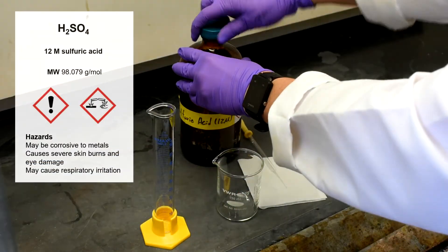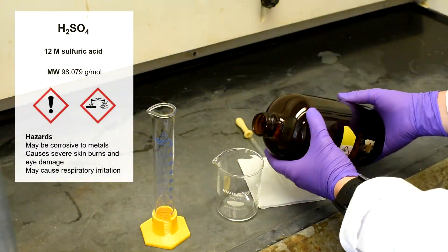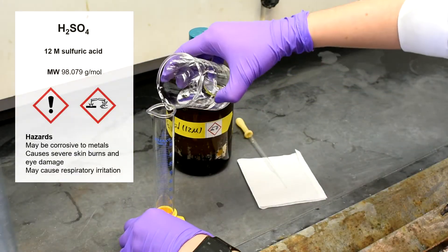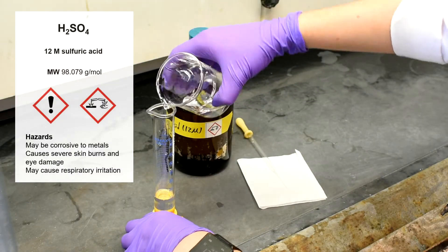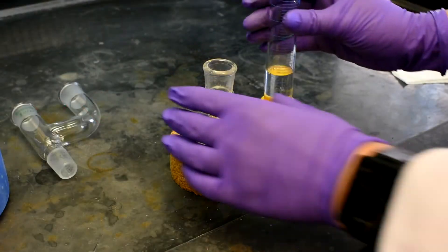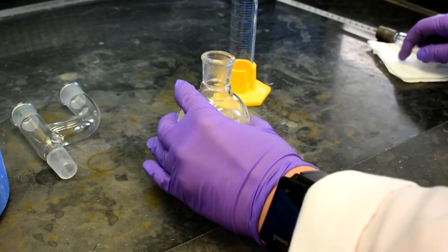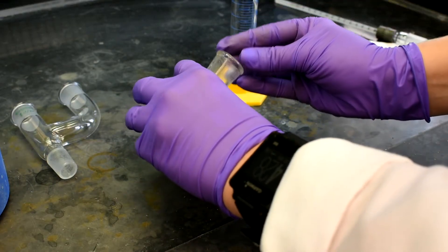Use a medium or large beaker to pour about 20 milliliters of 12 molar sulfuric acid. Use the graduated cylinder to measure 20 milliliters of the 12 molar sulfuric acid. Add the acid carefully to the round bottom flask. Tilt the round bottom flask and slowly add the stir bar.